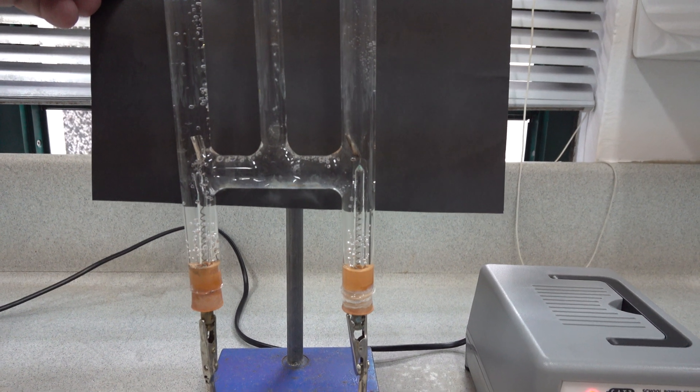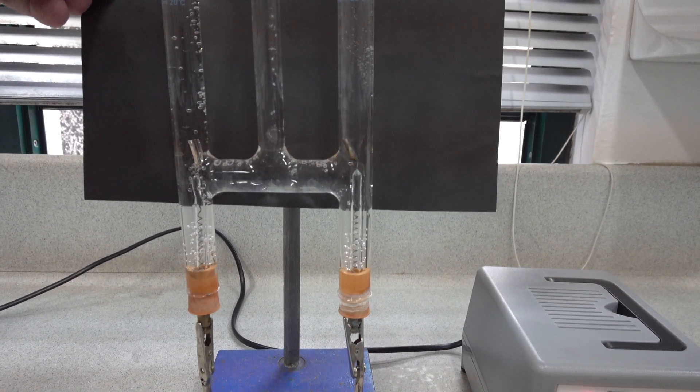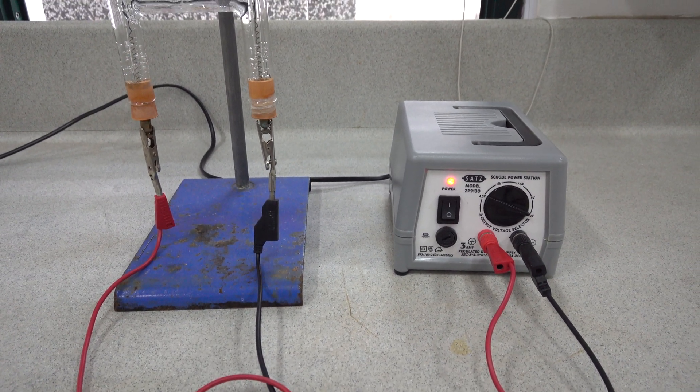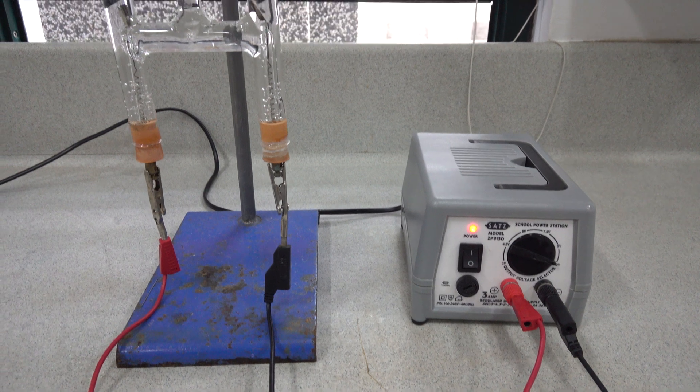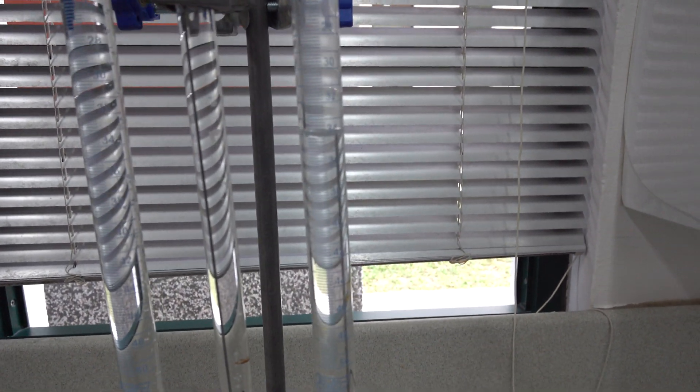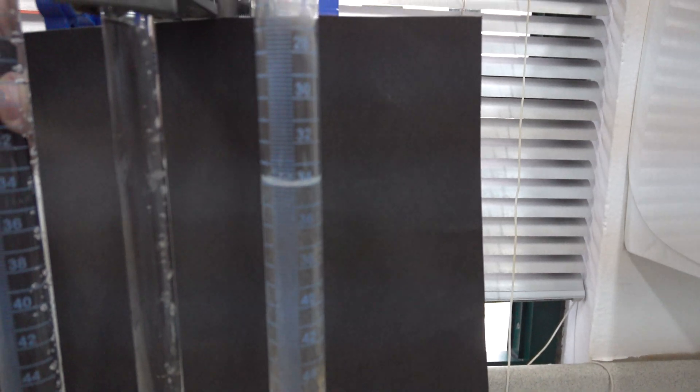We've got the cathode on the right and the anode on the left. In this experiment we're using about 12 volts DC.